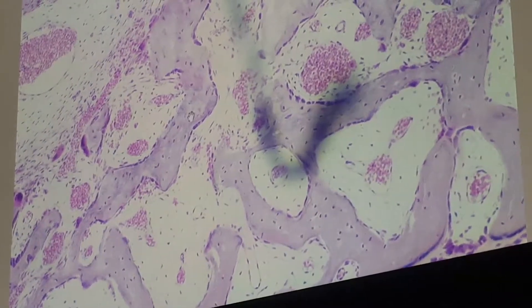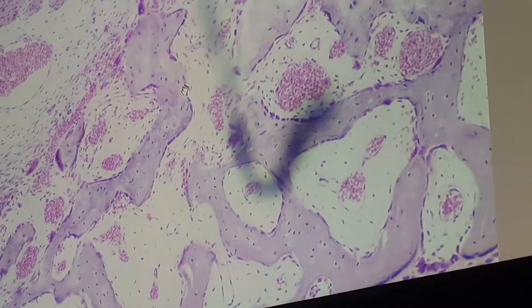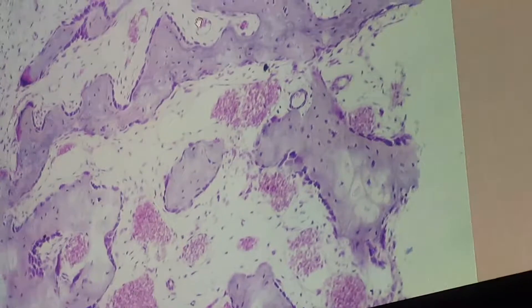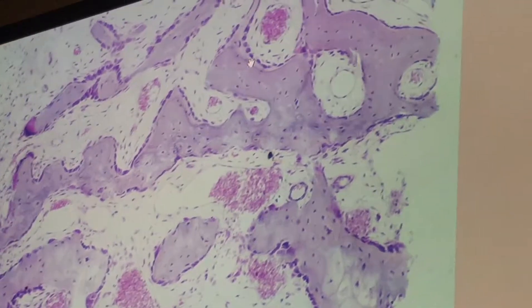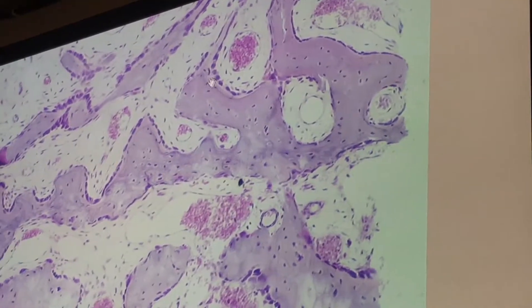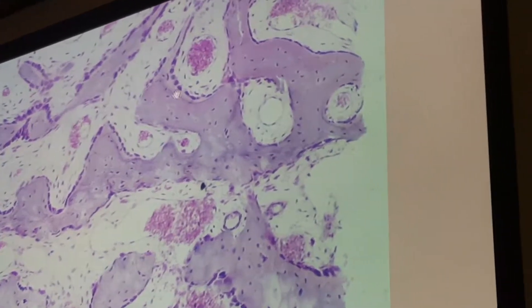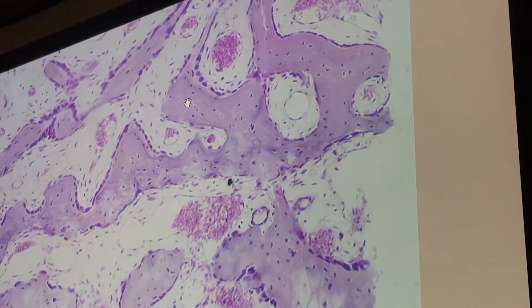Within the matrix we have osteocytes. At the surface we have osteoblasts. The layer located between the osteoblast layer and the previously formed matrix is called osteoid. Osteoid is non-calcified matrix, found between the osteoblast layer and the previously formed matrix.